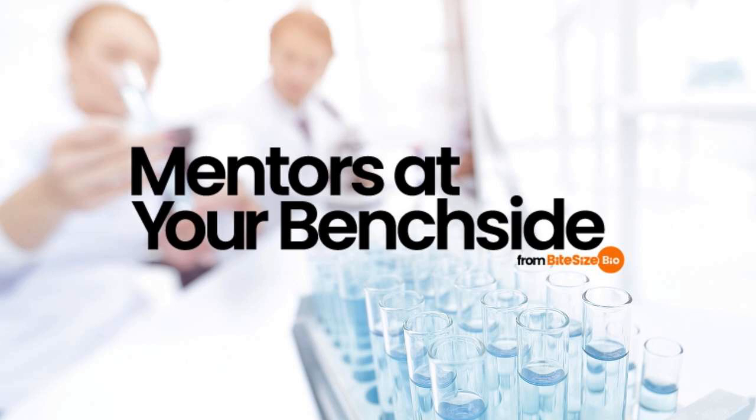Use an automated tissue dissociator for consistent extraction. Grind your samples up using a tissue dissociator rather than manually to help improve your batch-to-batch consistency in your lab and ensure that all your samples are processed the same way.